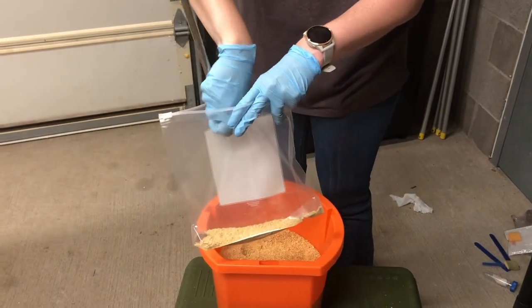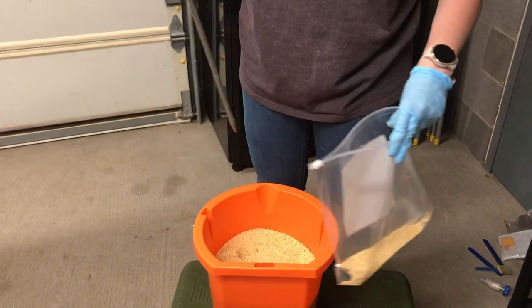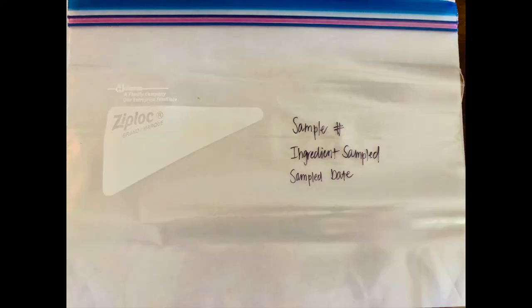This will be done eight additional times with all varying depths to make a complete feed sample using a feed probe. After you have collected 10 samples utilizing the double-sleeved probe, be sure to seal the plastic bag and, using your permanent marker, write on the bag the sample number, the ingredient or complete feed that was sampled, and the date the sample was taken. This sample is now ready to be logged and submitted for laboratory analysis.